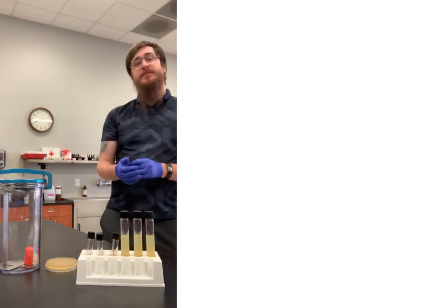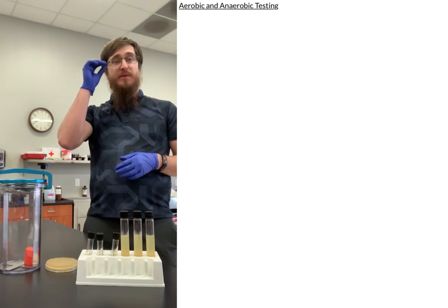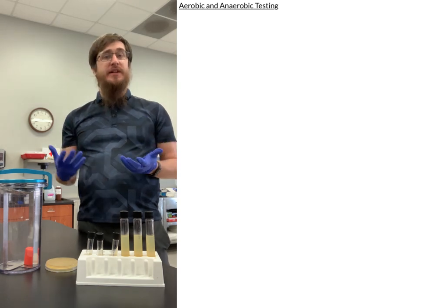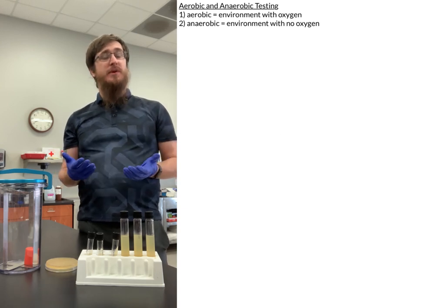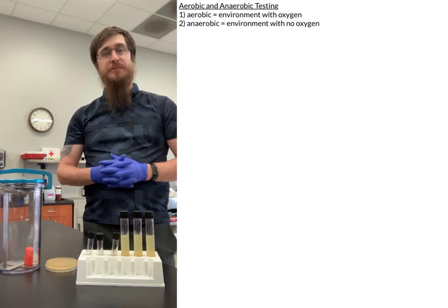Hey everybody! Today we're going to be talking about the aerobic versus anaerobic testing that we're going to be doing in our class. And when we talk about aerobes versus anaerobes, an aerobic environment simply means that there's oxygen present, whereas an anaerobic environment is an environment that does not have oxygen or lacks oxygen.